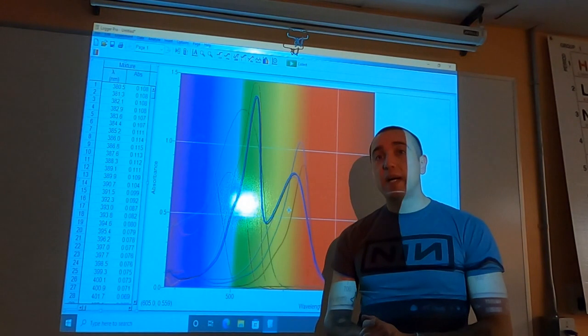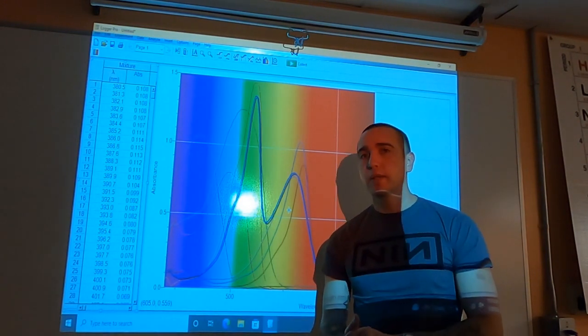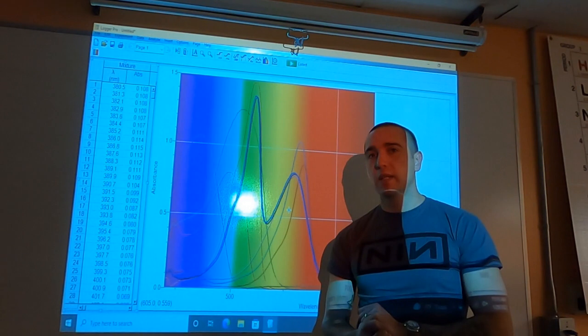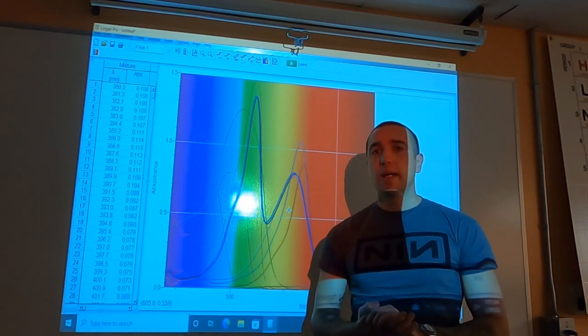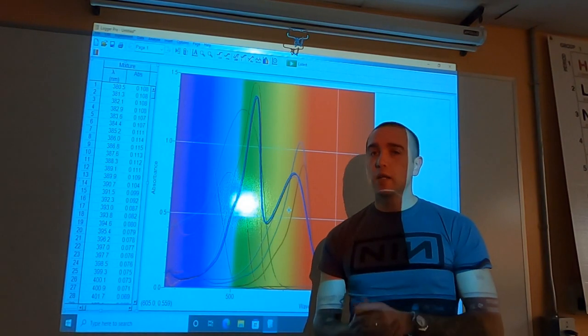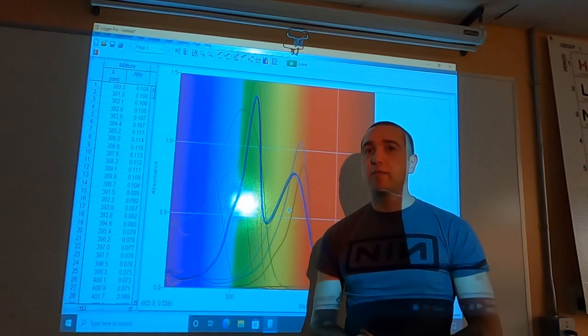Hey, so I've collected all my data now, including the mixture, they're all graphed on top of each other, which makes it a little bit confusing. You can't tell which line is which. And so I'm going to show you how to do that. First, you want to make sure to smash that save button.